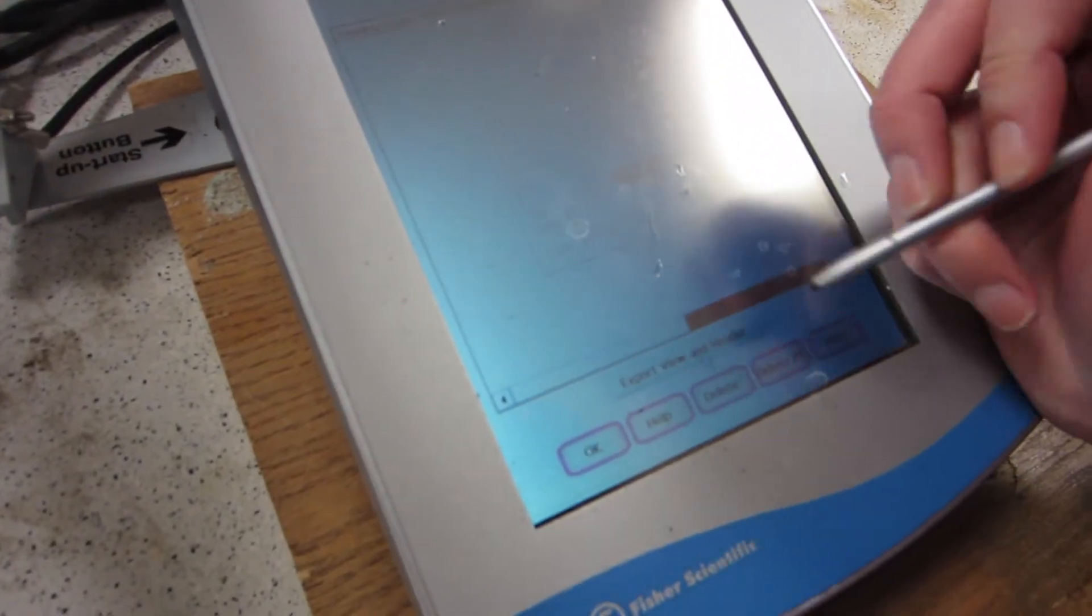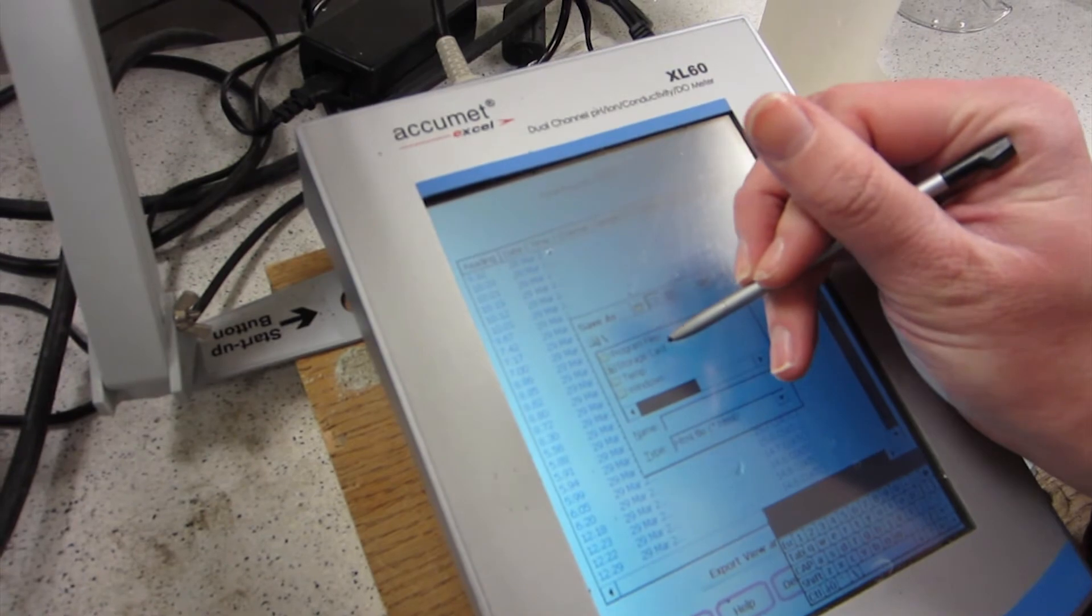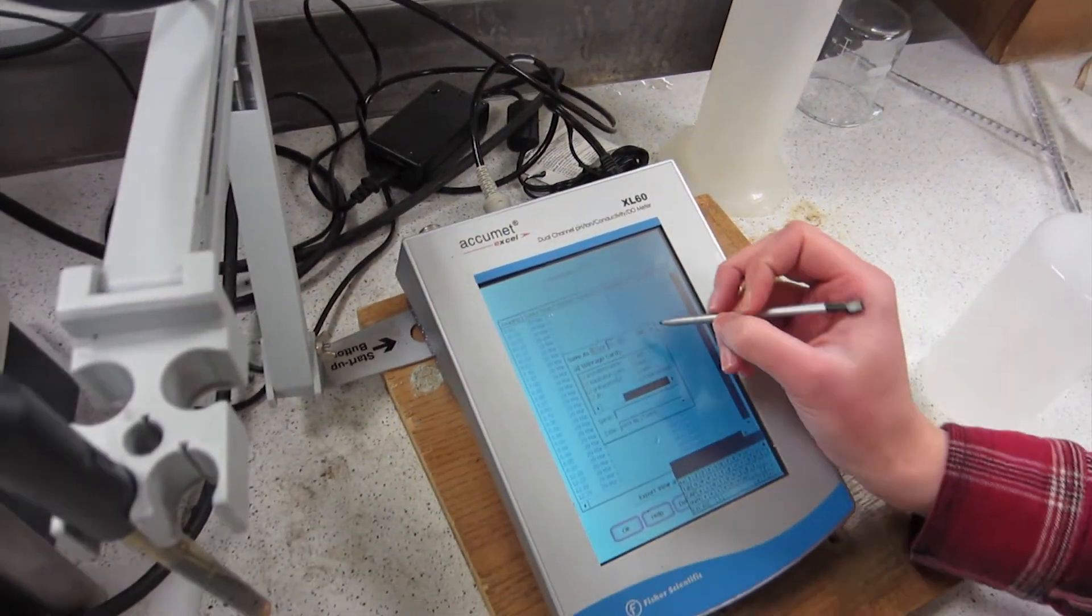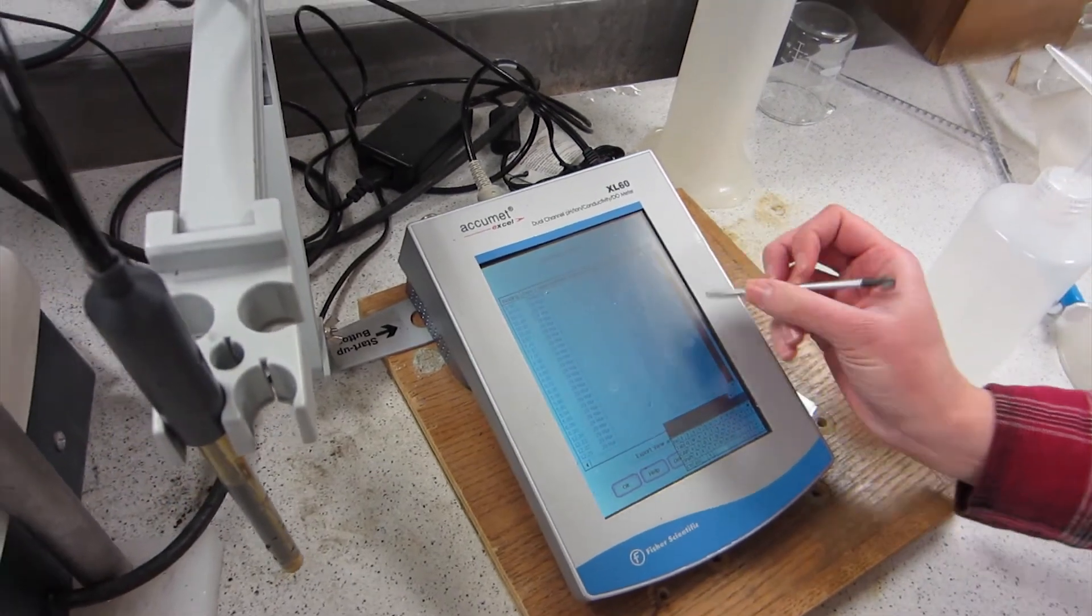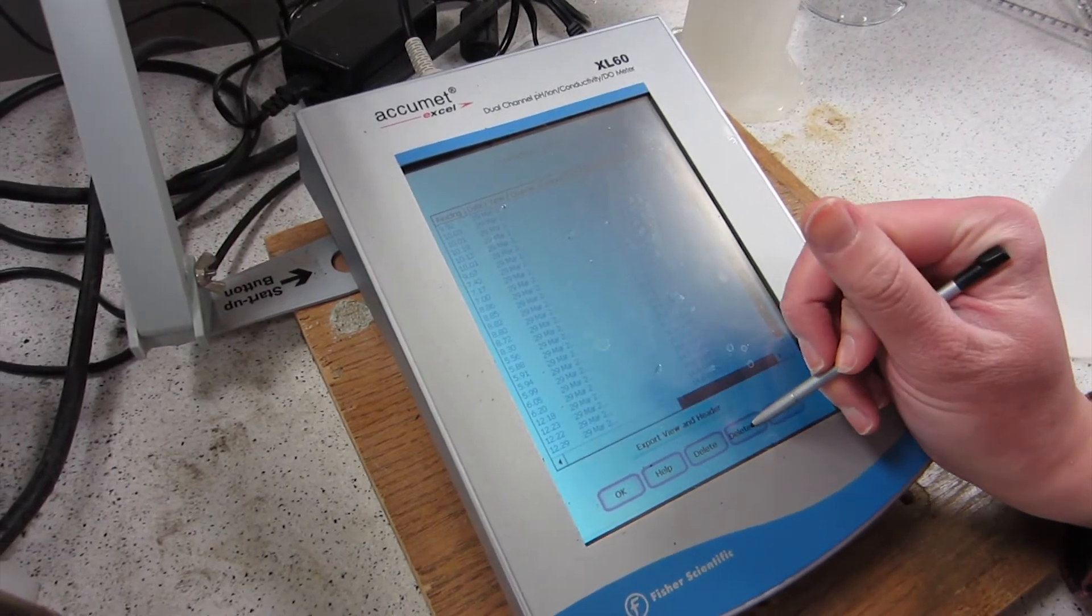You're going to go to export view and header. This will pull up these different files. You're going to hit storage card. Then you're going to save it in your specified file that you make on this storage card back here. So you're going to hit OK, and that will save it there. Then you're going to want to delete the data file, so when you take another data point, it's completely clear.